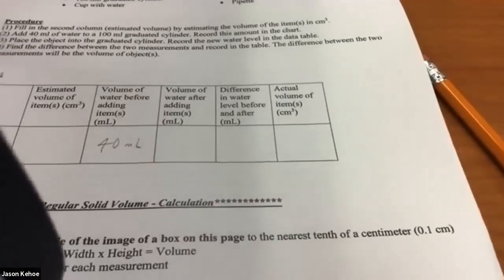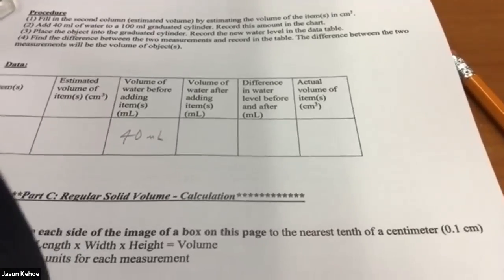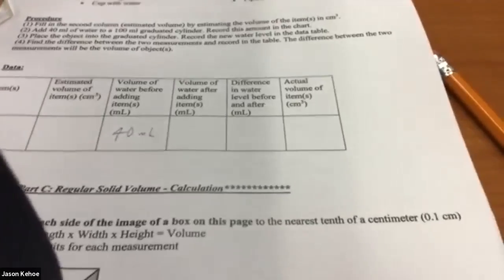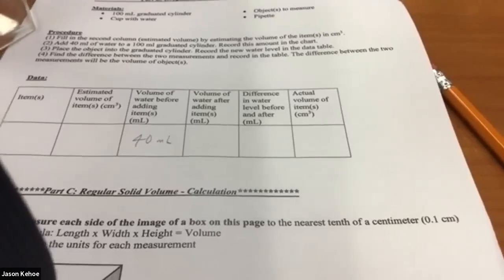And then finally, if you recall, because we said we use different units for solids than we do for liquids for volume, that last box there, you just take the previous box, the difference in water level before and after, that measurement in milliliters, and just turn it into centimeters cubed. Same number, you just change the unit. Remember, a milliliter and a centimeter cubed are exactly the same size.